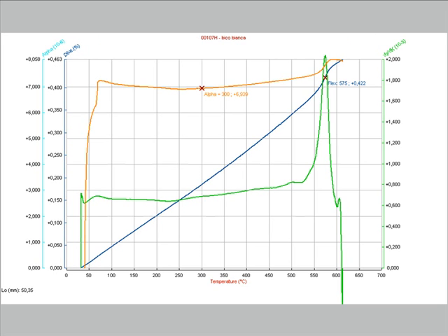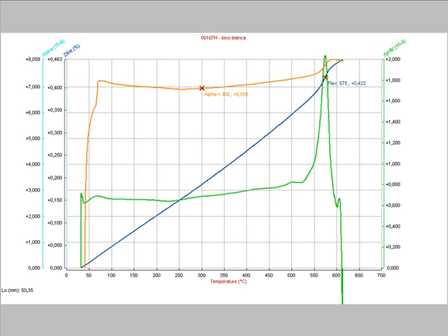The optical dilatometer gives the same results as a traditional dilatometer, and it can be used on the same materials with the same test procedure. For example, this is a traditional porous ceramic body, with the quartz transition highlighted by the first derivative of the expansion.